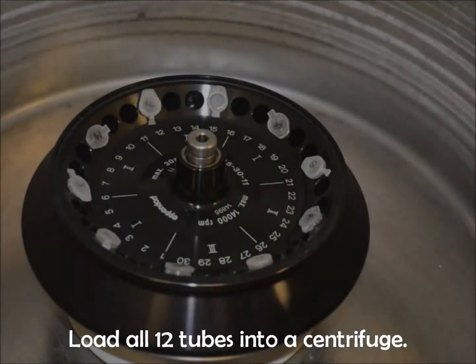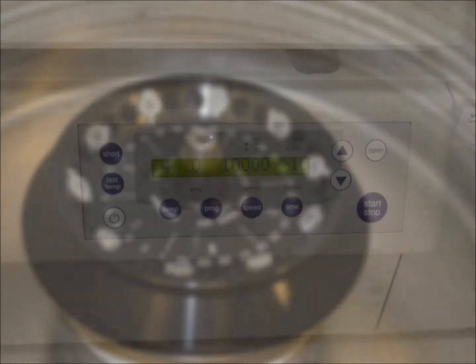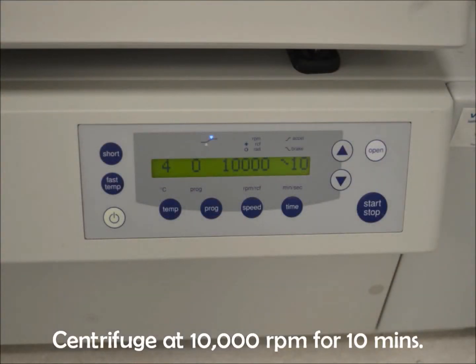Repeat the procedure for the rest of the vegetable samples. Load all 12 tubes into a centrifuge. Centrifuge at 10,000 rpm for 10 minutes.